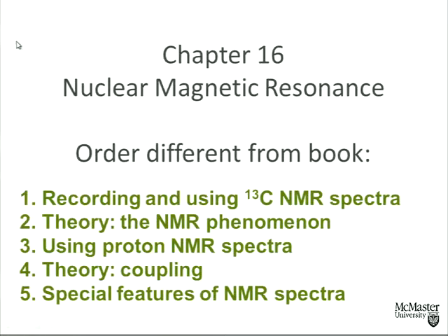And finally, by measuring the extent, the strength of that connectivity signal in the NMR spectrum, we get information about the geometry of the molecule, whether, for example, an alkene is cis or trans, E or Z.